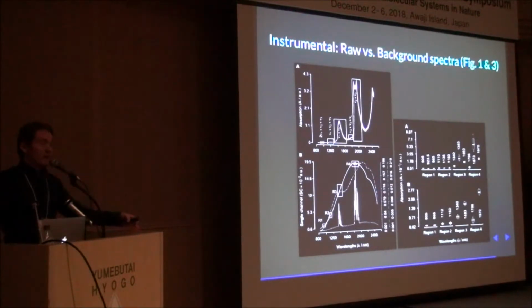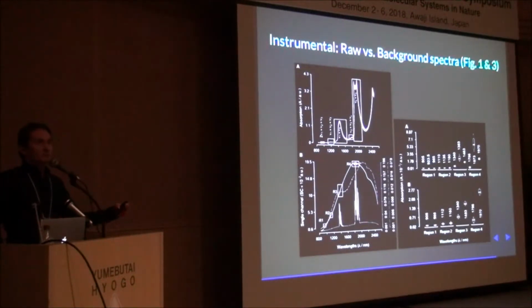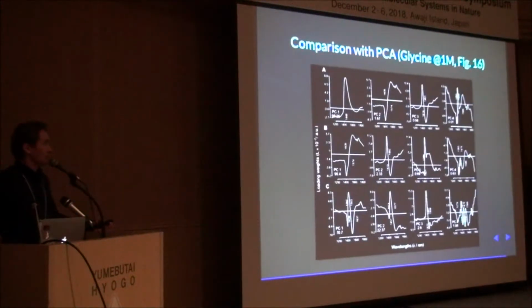And it is in the order of magnitude that your bands are in, let's say, a relatively diluted solution. If your solution is concentrated enough, 1 molar, then you're not going to have this problem. You're going to start getting these problems as you go deeper in dilution in some more realistic cases. So the conclusion here is even baseline shifting can contribute. I'm showing the part that is related to instrument, but of course there is also sample related baseline shifting. But it is not something that you can just brush off and say, no, it's not important, it's too small.